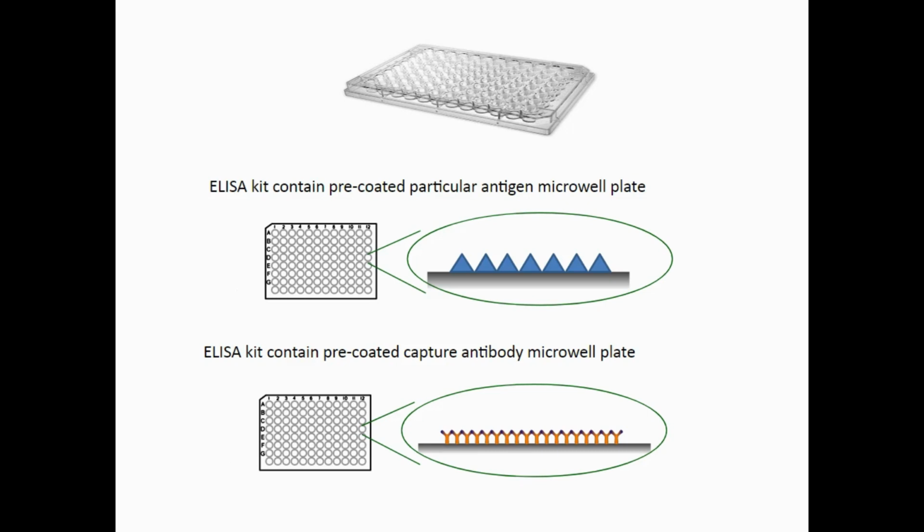I hope I'm clear now. These primary antibodies are taken from human serums. Secondary antibodies are synthesized in the labs by the introduction of the primary antibody to an animal species. So the secondary antibody is basically synthesized by human beings, in laboratory settings.